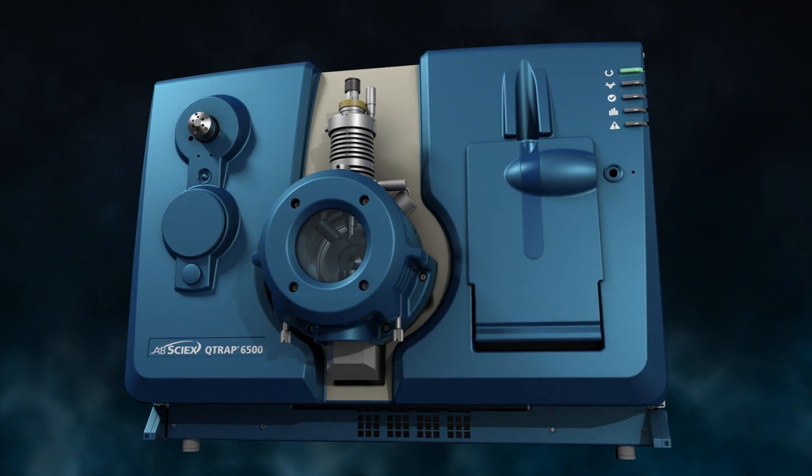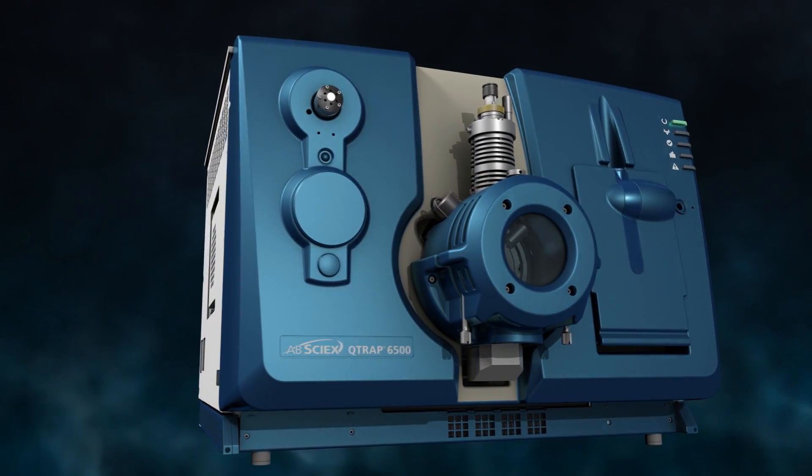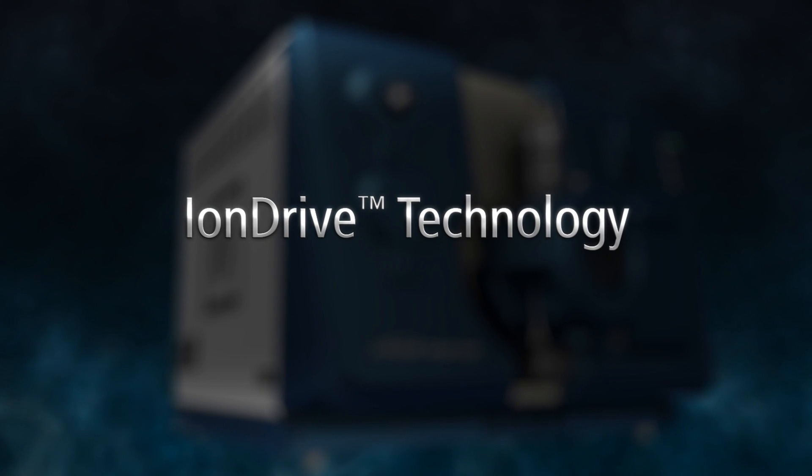Introducing the new AB SciX 6500 LC-MS-MS series with revolutionary new multi-component ion drive technology.